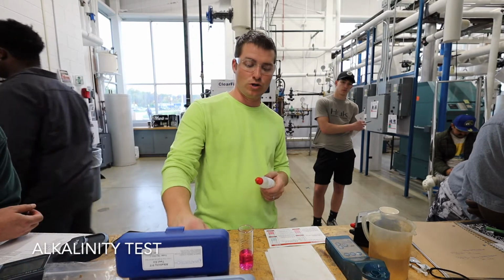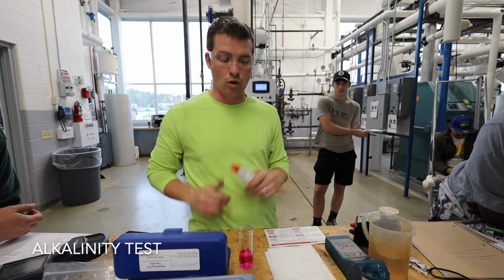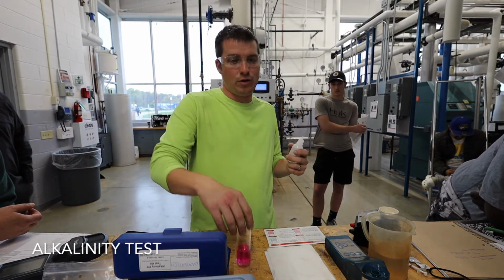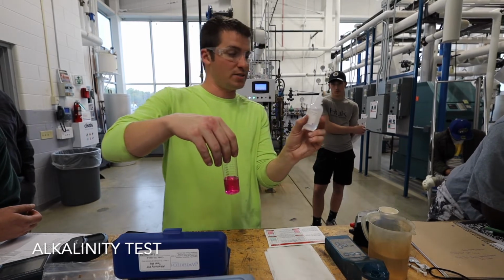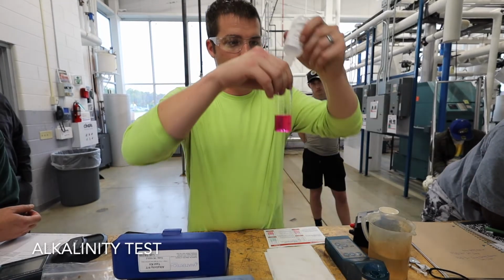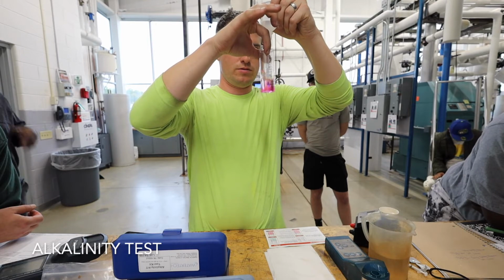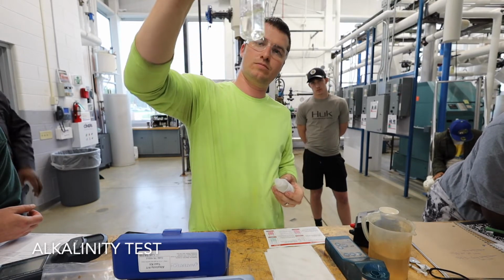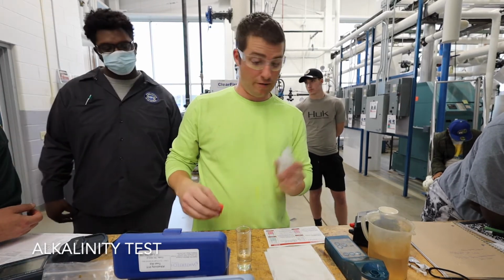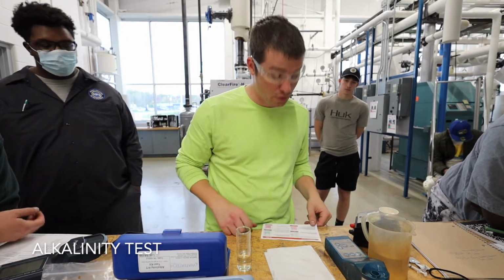And the reason being, if we do 1 drop equals 10 and I have 300, you're gonna add 30 drops versus me adding 6. You can stand here and do it all day if you want, but I don't wanna stand here all day. So we're gonna add this 1 drop at a time until it goes from pink to clear, and then that's our P alkalinity. So 1, 2, 3, 4. 4 drops, and 1 drop is 50, so 50 times 4 is 200. We gotta remember that.